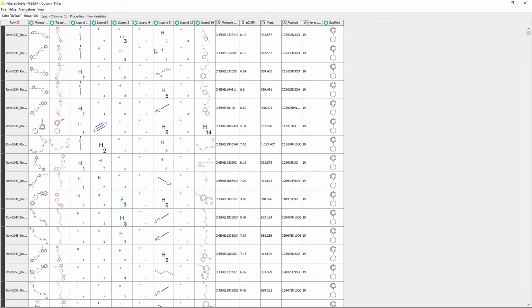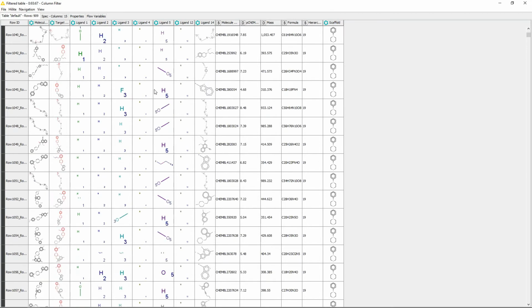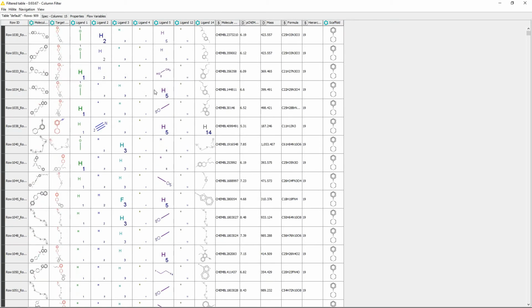There are quite a lot of them where almost every time just a hydrogen atom occurs, and there are these 7 ones where we have something different than simply hydrogens, and then we can also take a look at them and find the positions.